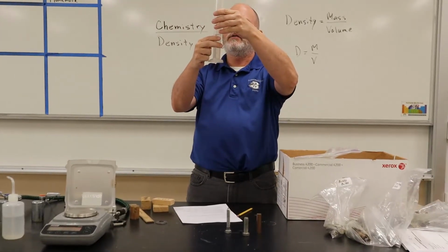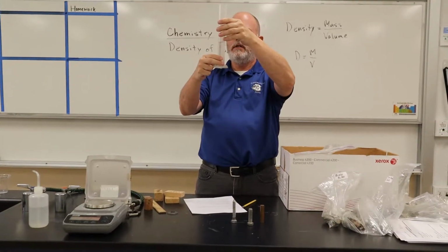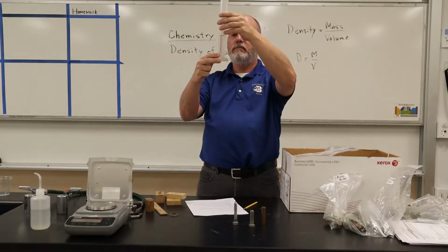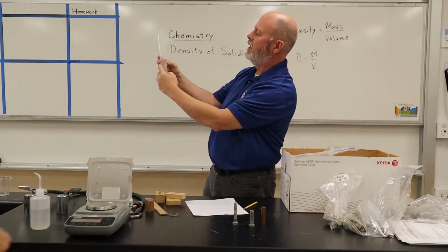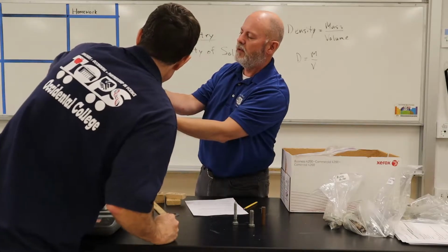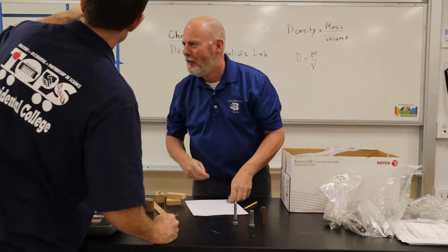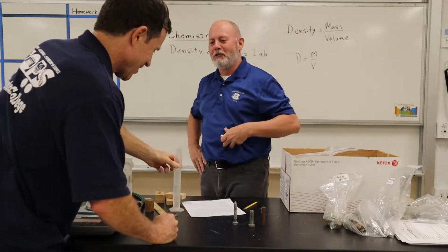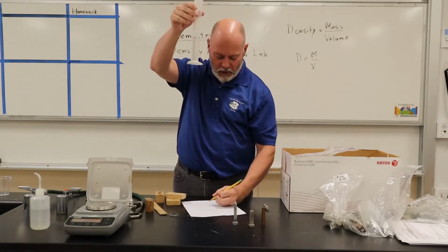Wow, my eyes are getting old. What is that? 20, 10. Oh, 45, right? Can you verify that? About 45. What is that, Sonny? Yeah, it's 46. All right, 46. So there's 46 milliliters of water in here.